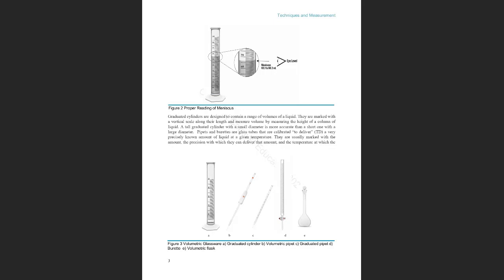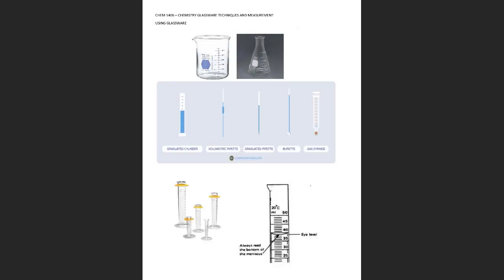We are going to see that this is a graduated cylinder. We use different kinds of glassware to measure volumes. Let me share a page with different pieces of glassware, because there are many things that I wanted to show you. Okay, these are different pieces of glassware, and there is one video that you need to watch, and then some questions are going to be in the quiz that you need to address. There are so many pieces of glassware.